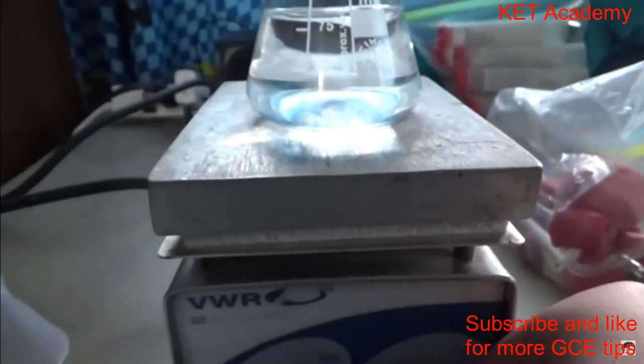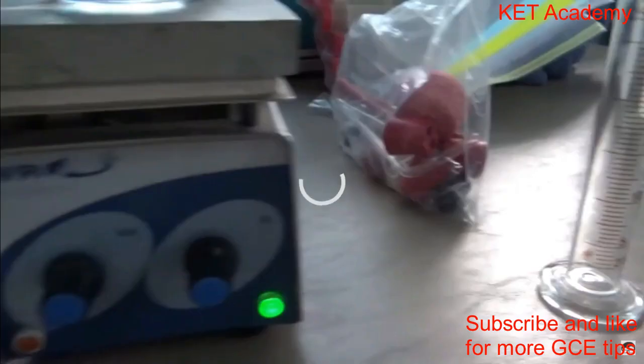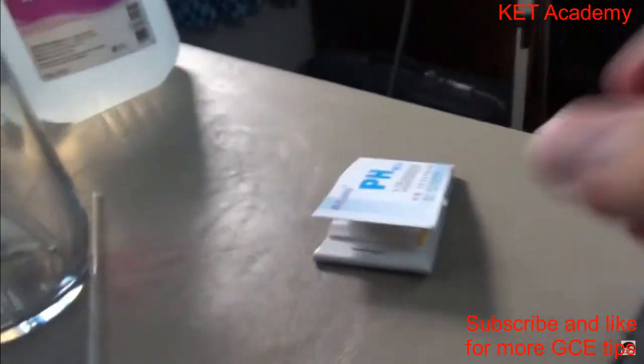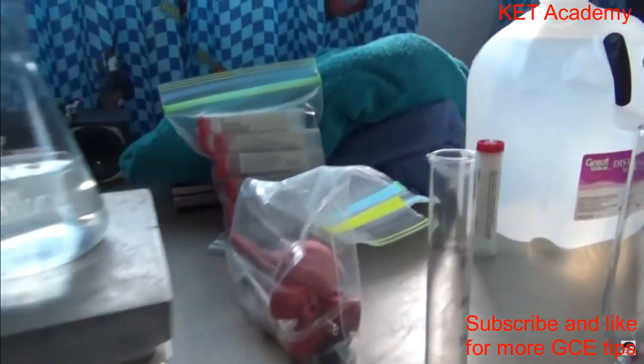Okay, while that's stirring, I'm actually going to add a few more crystals to there. Just a couple more, just to make sure. Actually, you know what? Let's run one test first. So I've got my pH paper here. I want to test the pH. You can turn that off.